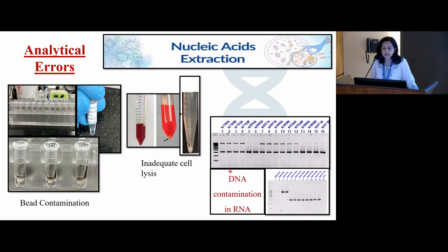Now come to the analytical errors. It starts from the nucleic acid extraction. If you are not using blood directly and are using WBC pellets, make sure your lysis is adequate.